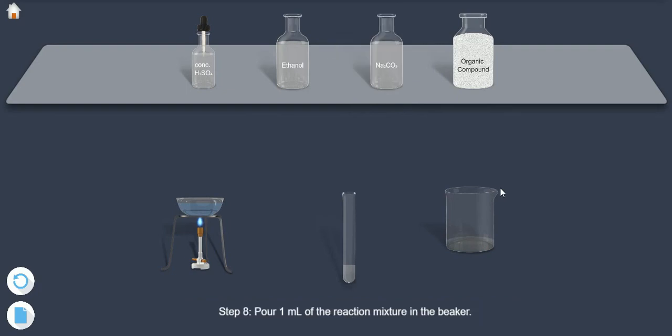Step 8: Pour 1 ml of the reaction mixture into the beaker.